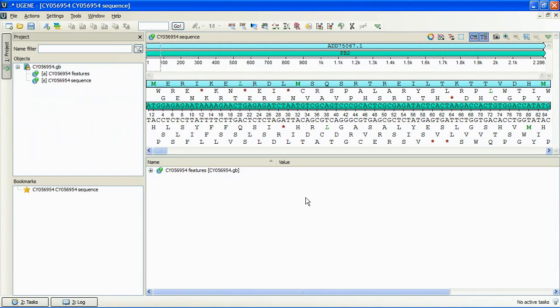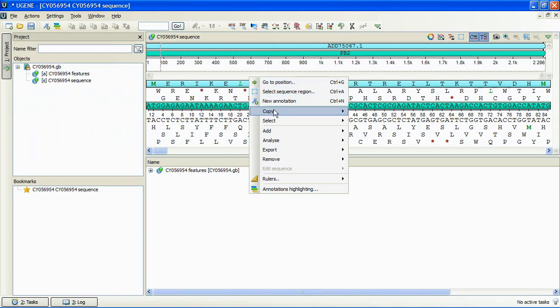When the download is finished, we see the annotated sequence. To evoke the plugin, we activate context menu and select Analyze Restriction Sites.